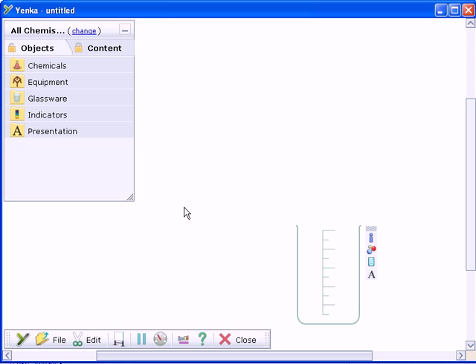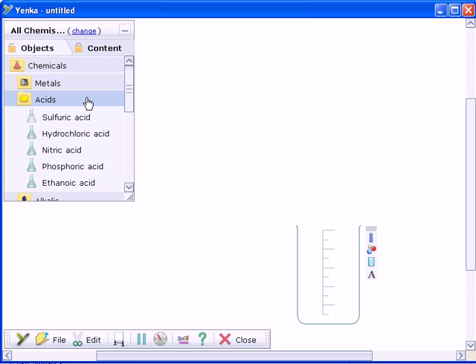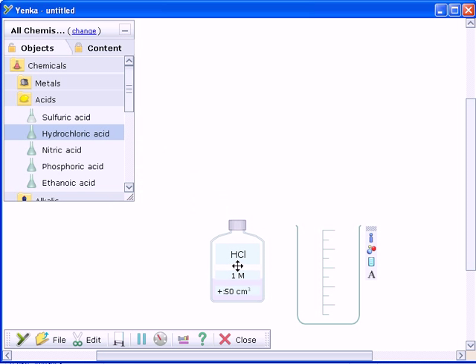Yenka in Organic Chemistry lets you simulate experiments with over 100 chemicals, choosing the mass, concentration and form you want.